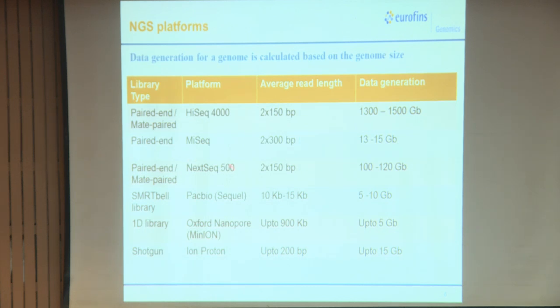So, when we are calculating, for example, if I want to go for a genome of 50 MB, how do we go for a genome? We consider a coverage. I do not sequence 50 MB only. What we do, we sequence 50 into 100. That is, one particular region of the genome I want to be sequenced 100 times. When we talk about coverages, if we have read genomic papers, we have a word called sequencing coverage. We have sequenced it at so and so coverage.